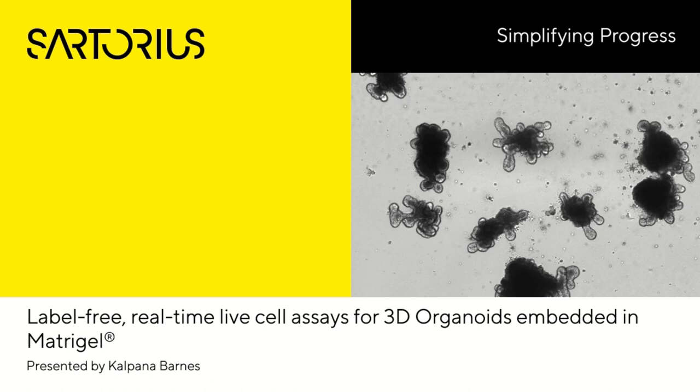Today I will be discussing and walking you through a poster previously presented at the April 2022 American Association for Cancer Research, titled Label-Free Real-Time Live Cell Assays for 3D Organoids Embedded in Matrigel.